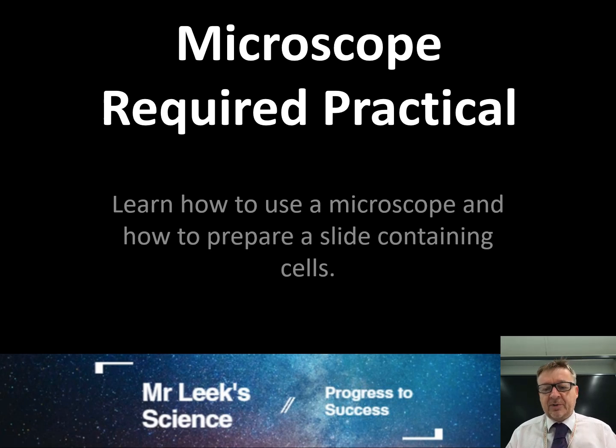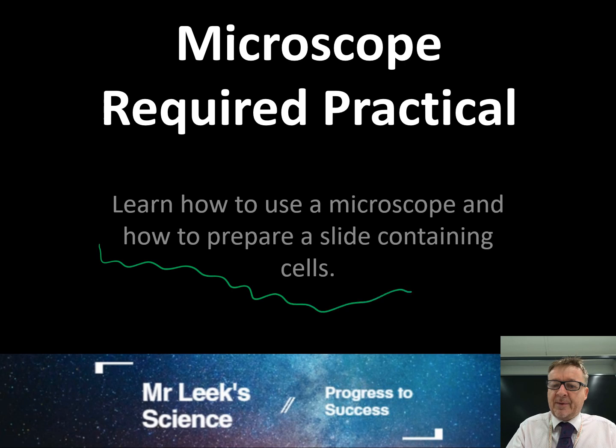This is the microscope required practical - the first of the biology ones. The whole point is to learn how to use a microscope and how to prepare a slide containing cells, usually onions.